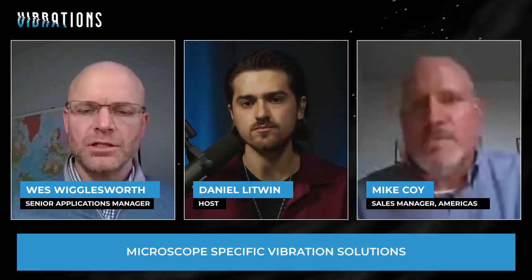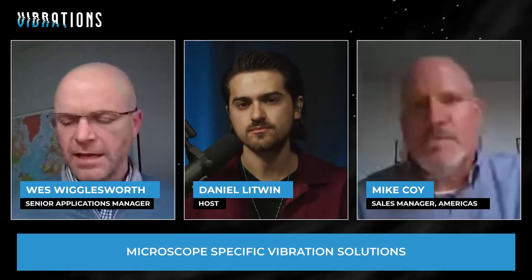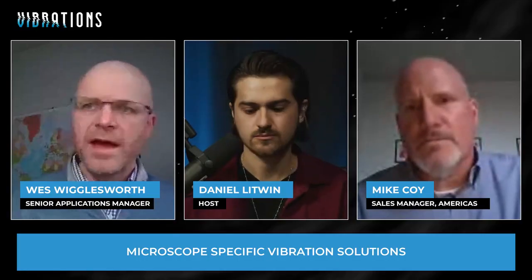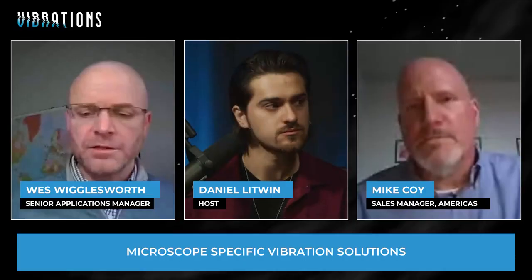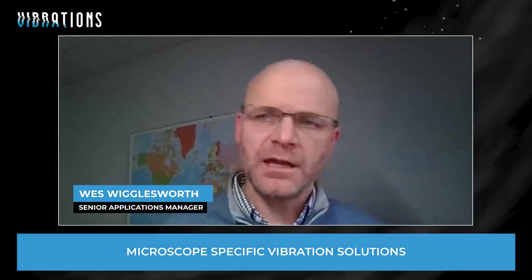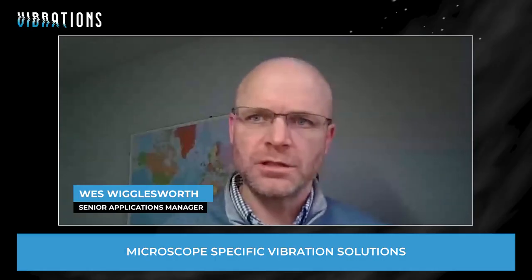Yeah, and I just want to add to that, Daniel. Mike brought up some really good points about the manufacturers. They all have their own spec. And you asked about custom specs. Are there standard specs? And I think at the beginning of the discussion, you mentioned VC curves. So VC curves are a vibration criteria standard. VC stands for vibration criteria.